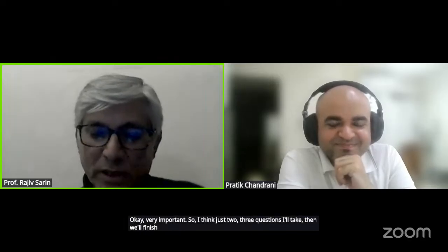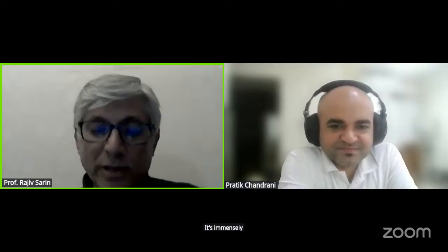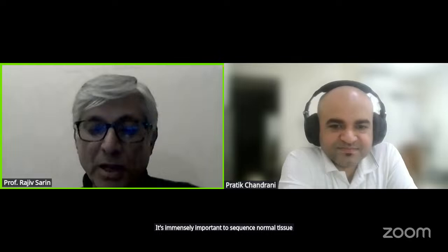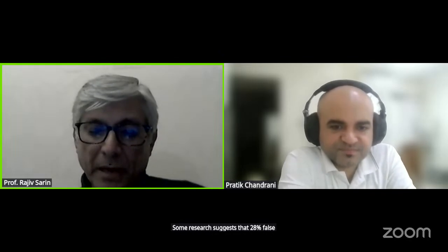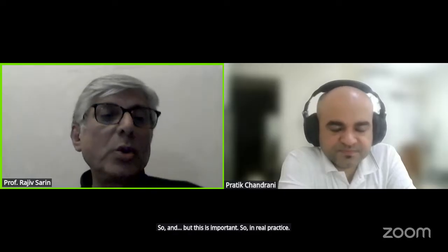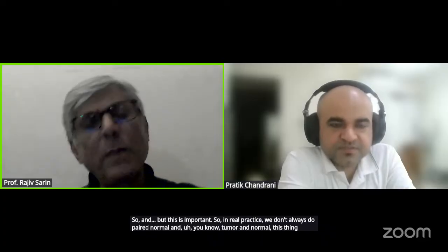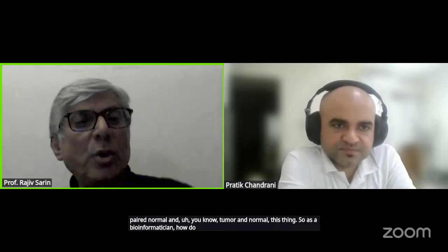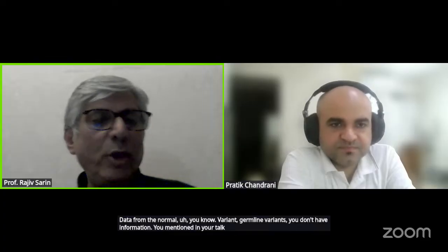So Mohammad Sanawar Hussain has asked how to avoid false positive results. It's immensely important to sequence normal tissue with tumor tissue. Otherwise, some research suggests 28% false positives, but it would be very expensive to do both. But this is important. So in real practice, we don't always do paired tumor and normal. So as a bioinformatician, how do you deal with it? Because you don't have the data from the normal, you don't have information on germline variants. You mentioned it in your talk, but again, if you can just summarize it.